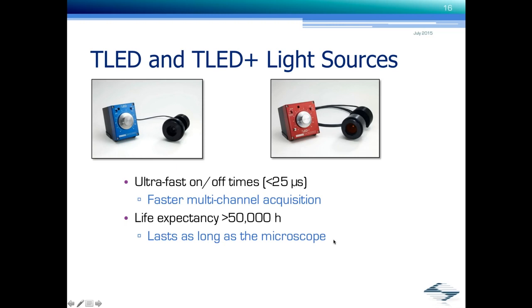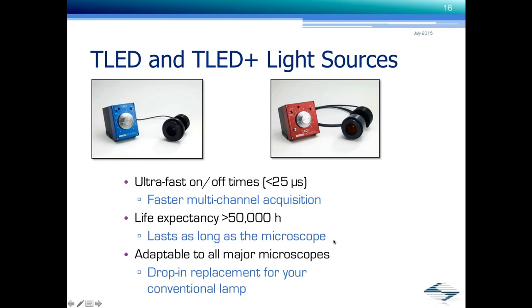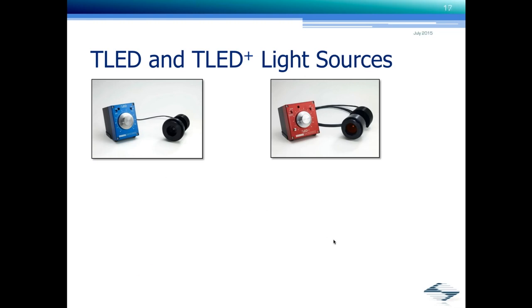Quickly did the math a while ago and came up with a figure, if you use it about 8 hours a day or something like that, it will outlast your research life, depending on your age, and probably even most of your postdocs. Definitely will last as long as the microscope, much longer than the conventional lamps. And they're adaptable to all major microscopes. In many cases, it's even a drop-in replacement for a conventional lamp.